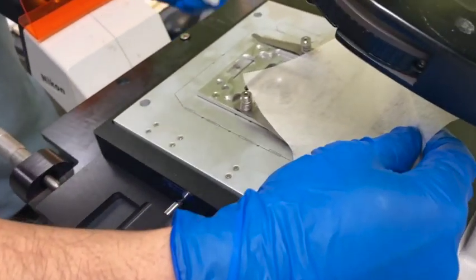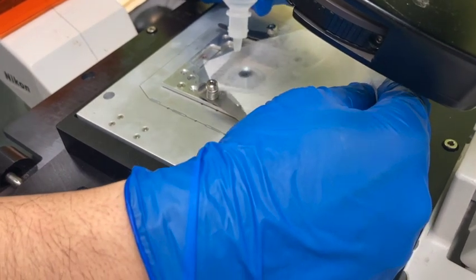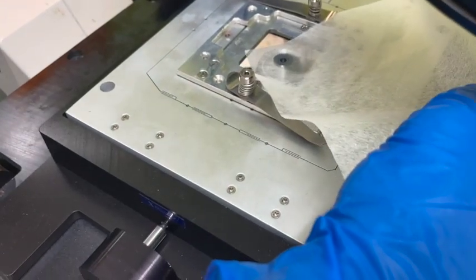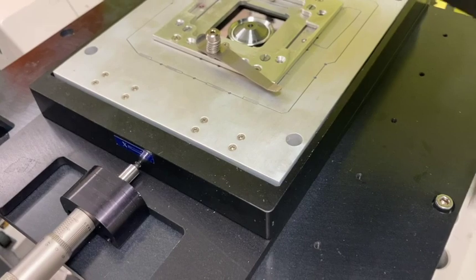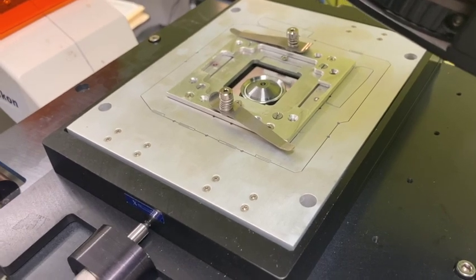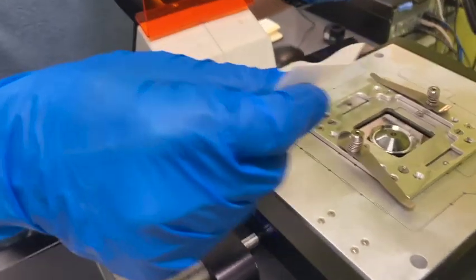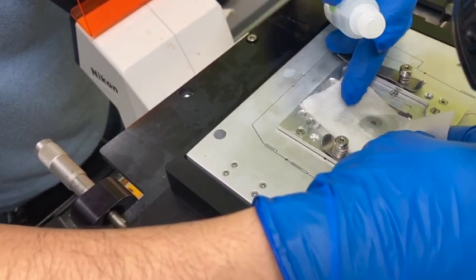Put this over the objective, and you put a drop. When you put a drop, it's going to contact the drop, and you just drag it slightly. That's the right way to do it. But again, I said before, just so you know what's the best way to do it. That applies the minimum force as you drag it, and it also cleans the surface.